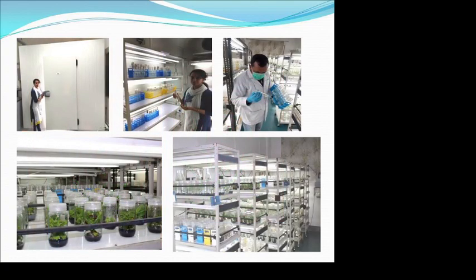Now this is the growth room where you have to maintain your culture, and it's just like when you saw the first slide. I was giving an analogy of a baby inside a test tube, with a plant inside a test tube. So basically you are giving the best of the conditions. In this room, the plants after inoculation are given the best conditions, that is best temperature, light, as well as humidity, which is required for optimum growth.